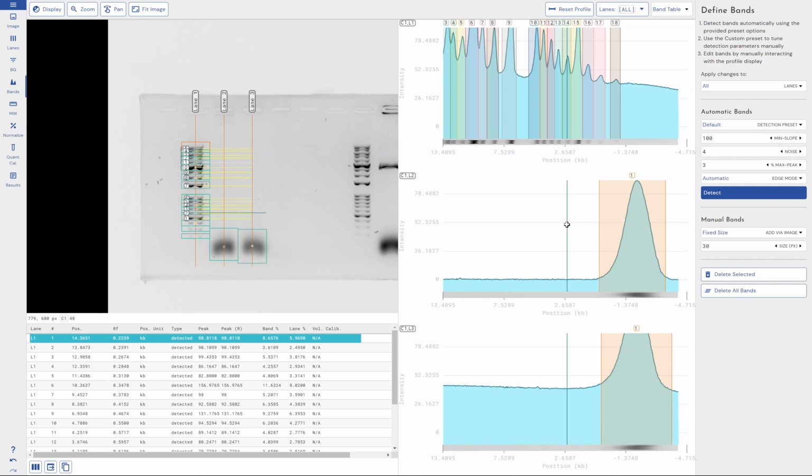So you can work with it in real, well, not real world units, but calibrated units rather than trying to link every intensity, every band to an XY position that doesn't really mean anything to you experimentally. So we've now got context for our experiment, not just results in this table.